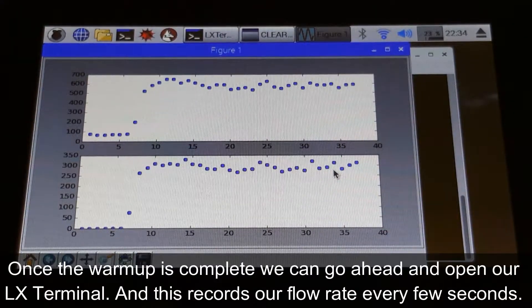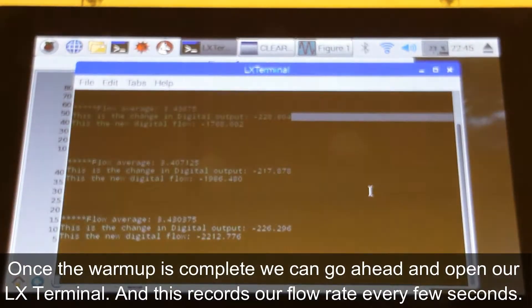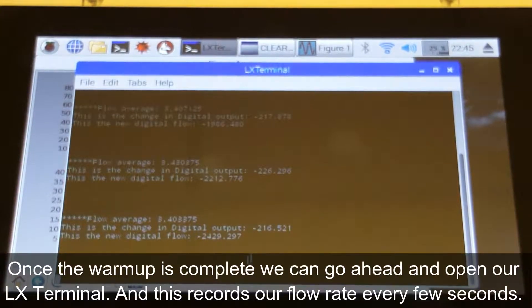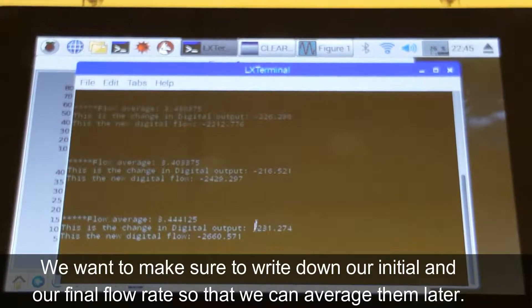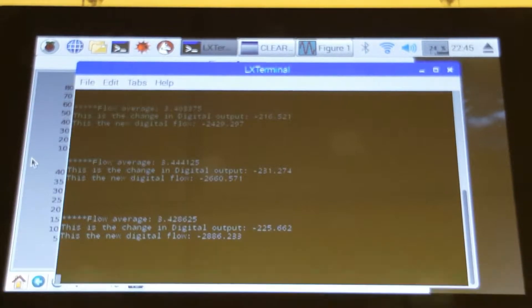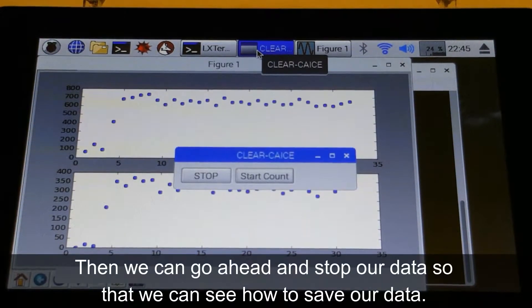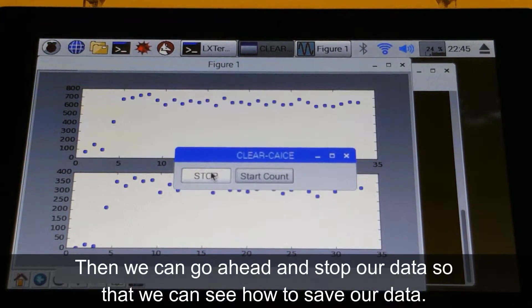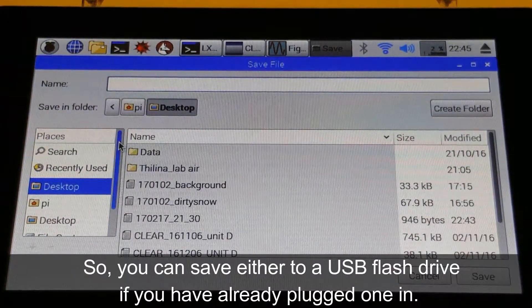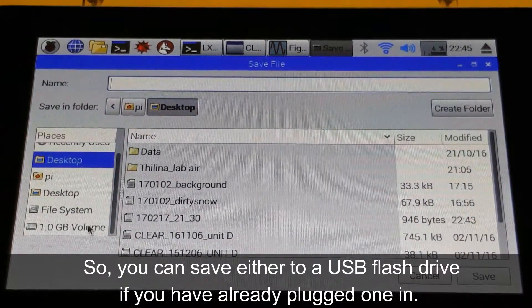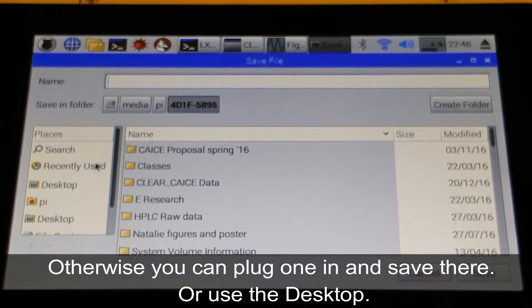Once the warm-up is complete, we can go ahead and open our LX terminal, and this records our flow rate every few seconds. We want to make sure to write down our initial and our final flow rates so that we can average them later. Then we can go ahead and stop our data so that we can see how to save our data. You can save either to a USB flash drive, if you've already plugged one in, otherwise you can plug one in and save there, or use the desktop.